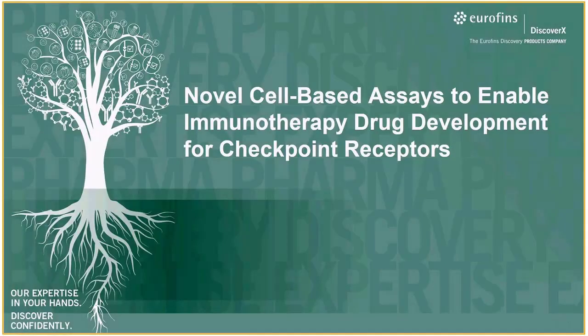In today's webinar, we'll focus on novel cell-based assays to enable immunotherapy drug development for checkpoint receptors.